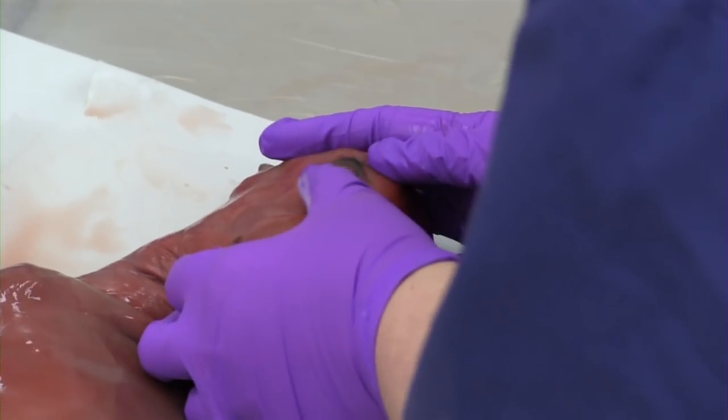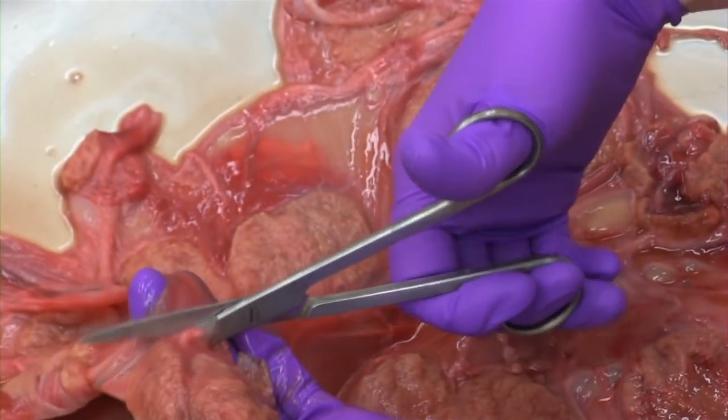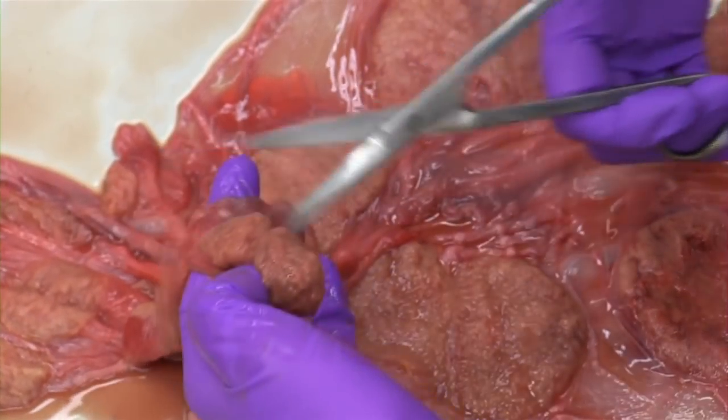The ideal specimen to collect for an abortion or stillborn workup is the entire fetus and a portion of the placenta. This is not always possible due to the size of the calf or the time constraints that may occur over the weekends and holidays.